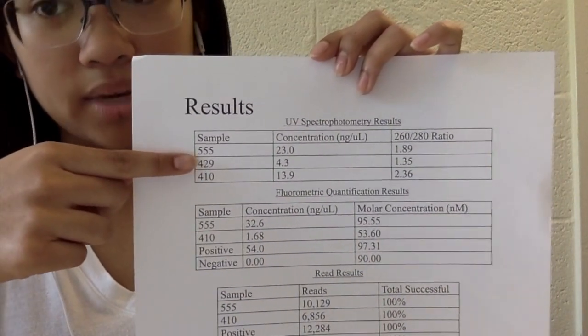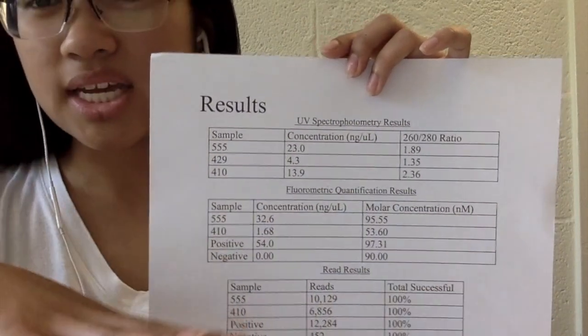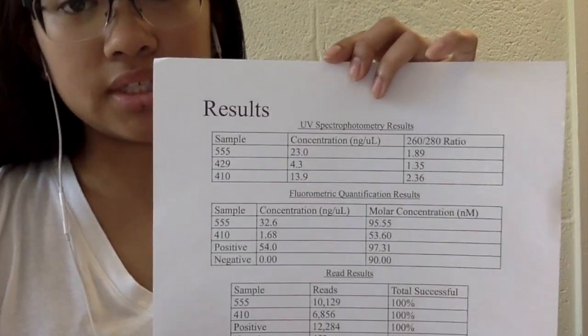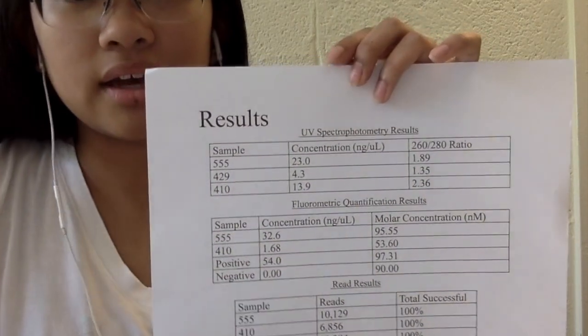For our sample 429, our 12-year-old snake, the UV spectrophotometer results showed a low DNA concentration, meaning we could not use that sample for further analysis because there was not enough DNA to analyze.